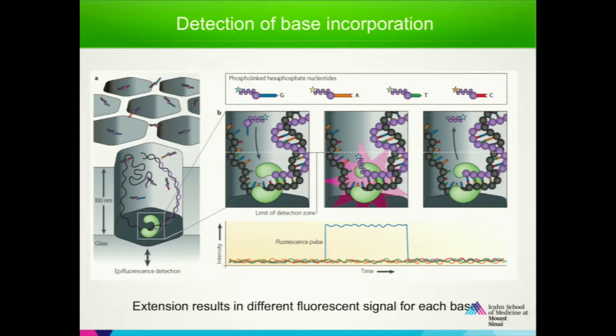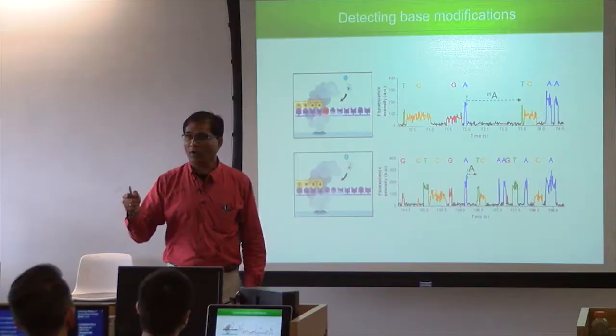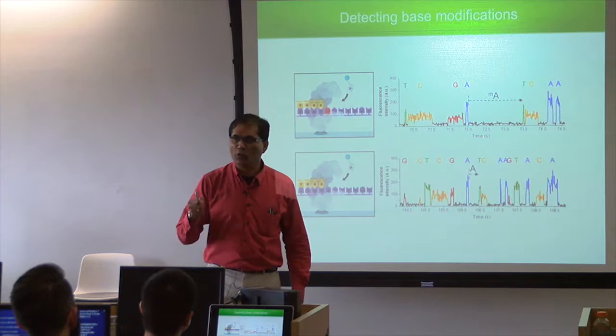Okay, very simple reaction. So according to me, this is the first biochemical reaction which ever got videotaped. Okay, so what you can do here, more beautifully, you can do all other things we discussed. Plus, we can do a lot of long read lengths. What else can we do? Essentially, if you look into this reaction, you are following the synthesis of DNA, but what else are you following here? You are following the kinetics of polymerase.